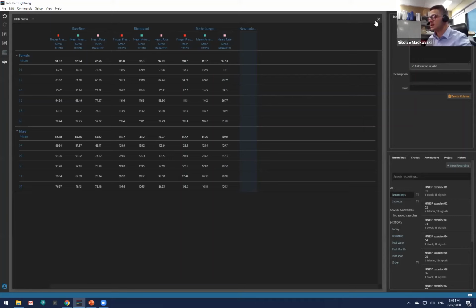So what I'm going to do is I'm going to say, for this instance, bicep curl. And let's just look at the difference. So what you see here is a little place to do some basic arithmetic. So what I'm going to do first, I'm going to click on choose a region. And remember, this is only going to be using based off regions. We're not going to add any numbers in here. It's only going to use regions. So it's limited to what it can do at the moment, but in the future, hopefully we can add the ability to add numbers so you can work out things like percentage change, those sorts of things.